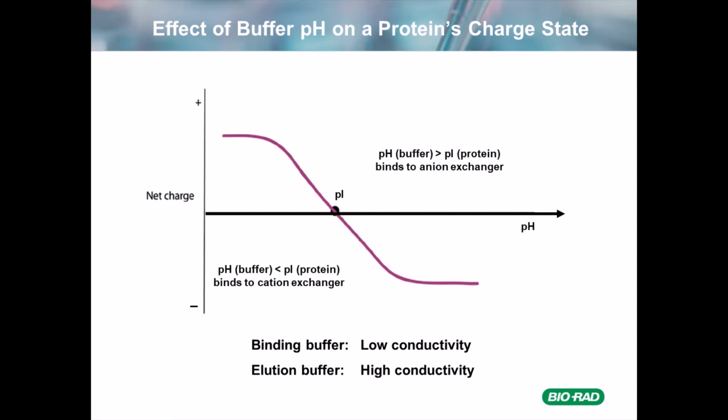This is a figure that you see often in textbooks teaching protein chromatography. It gives you the guideline for the selection of an ion exchanger and the matching buffer to purify a protein whose pI you already know. Typically, we prepare the feed in a low conductivity buffer to facilitate binding of the target protein by the resin. Once we finish washing the impurities, we can use an elution buffer that contains high salt concentration to elute the target protein.